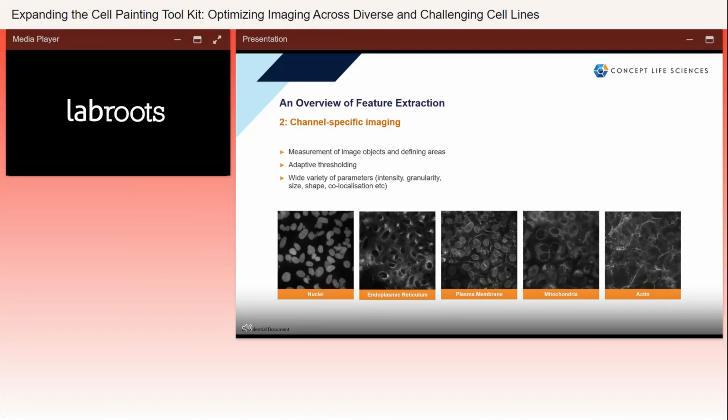The cytoskeleton is highly dynamic and responds to various toxins, while assessment of vesicle density, compactness and overall Golgi dispersal gives an indication of health. Each of these readouts contributes orthogonal information. When combined across channels, they can describe complex phenotypes such as cellular senescence, immune activation, or neurotoxicity.